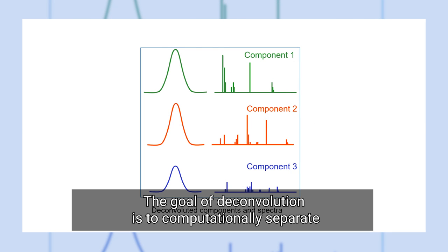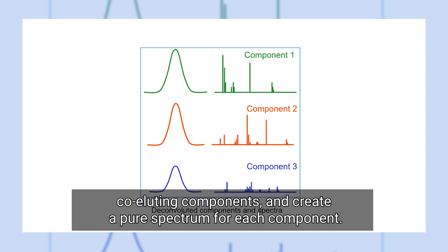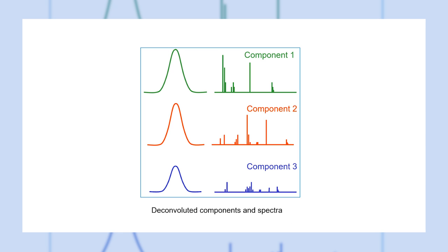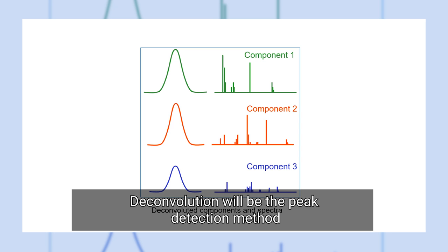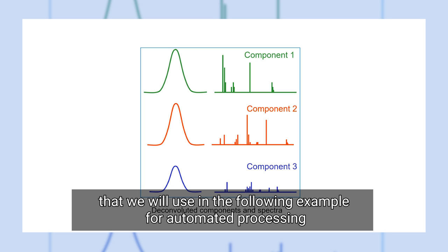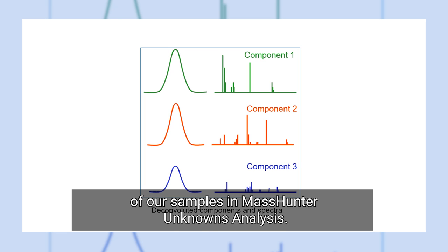Not only is it very difficult and time-consuming to figure this out manually, but we also have no real possibility to extract a clean spectrum from any of these compounds. The goal of deconvolution is to computationally separate co-eluting components and create a pure spectrum for each component. Deconvolution will be the peak detection method that we will use in the following example for automated processing of our samples in MassHunter unknowns analysis.